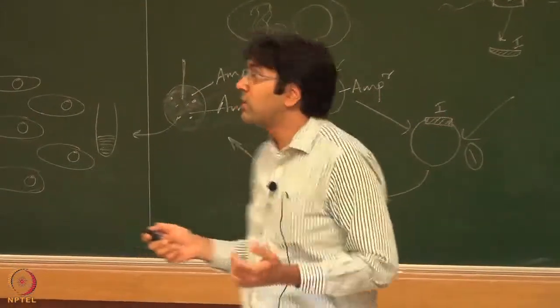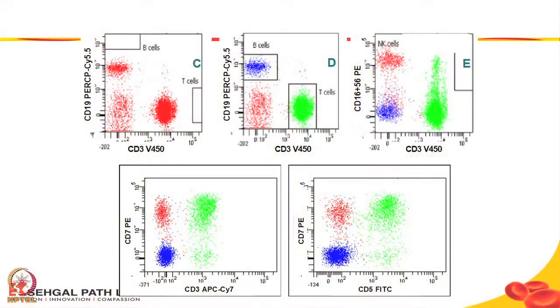Then we do some data analysis. Okay, these cells, the green ones are CD3 positive, so I know these are T cells. These are CD19 positive, so I know these are B cells. This is simply looking at lymphocyte subsets. Then we look at tumor cells and we say, okay, these tumor cells are of B type. These tumor cells are of T type and these are of myeloid type. Because every type has a different treatment, a different prognosis. So this is just what we do.